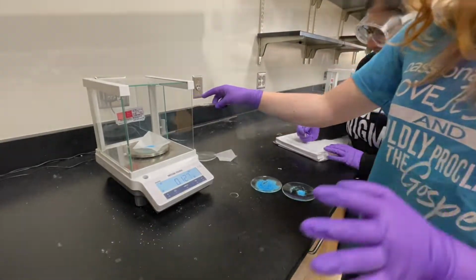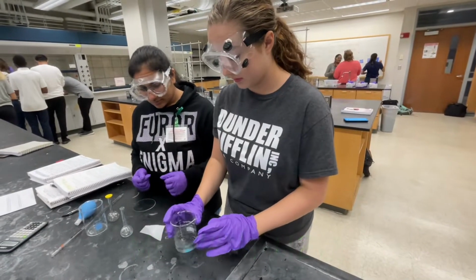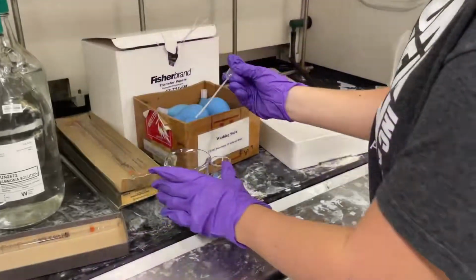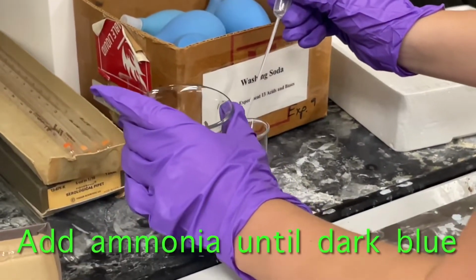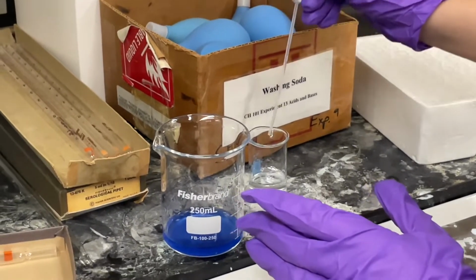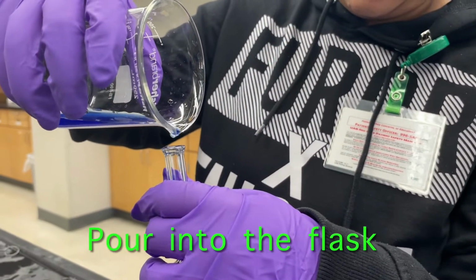In this lab, we were tasked with creating a stock solution, which was copper amine. We had to weigh out the copper sulfate pentahydrate and dissolve it in the water. After that, we had to add ammonia. After adding the ammonia, we poured it into the flask.